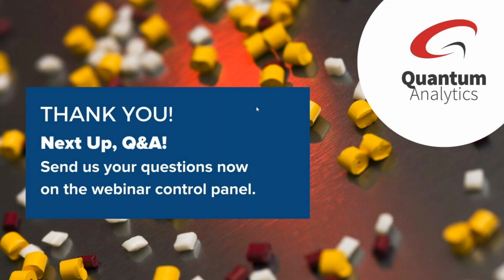So that's another great one. So how good can you do in picking up polymorphic changes? As it turns out, the Alpha and the Centera and essentially the Lumos as well, everything on the wavelength axis is accurate to about 0.01 wave numbers. And what does that mean? That means you're not going to collect the data at 0.01.